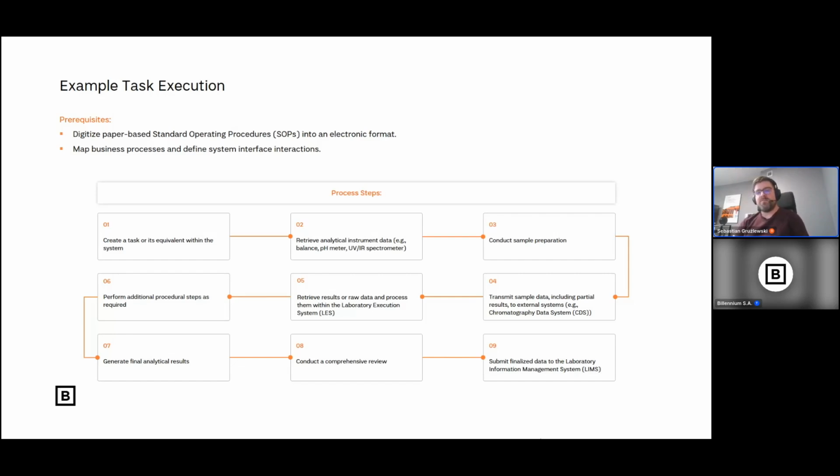So let's say you want to interface to your LIMS system. How to do that? Here we already have a problem, because you have a sample in your LIMS system, you have a sample or a method in your LES system. How to link them? There are two basic ways to do that. The easy way is to create a mapping table. So how to do that?